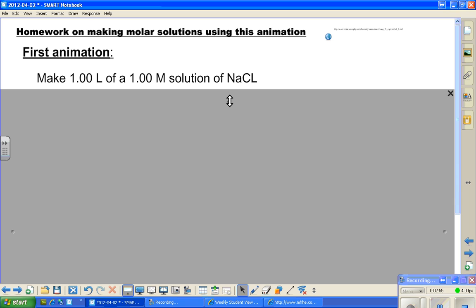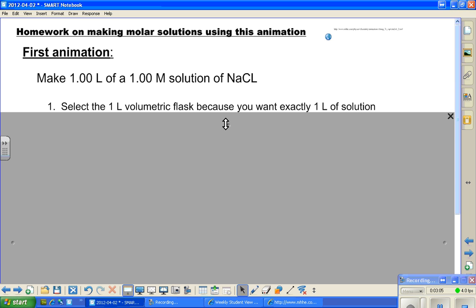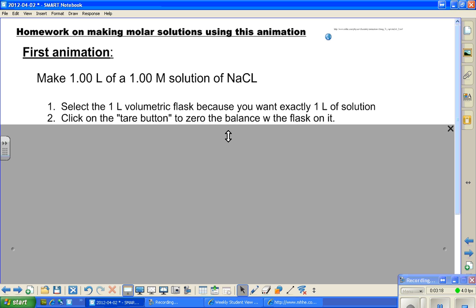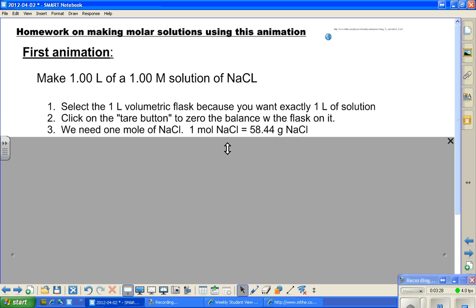In the first animation, I clicked on the make 1.00 liter of a 1.00 molar solution of sodium chloride, so I have to write that down. The first thing we did was select the 1.00 liter volumetric flask because you want exactly 1.00 liter of solution. Next, we want to click on the tare button that will zero the balance with the flask on it. Then we need to make one mole of sodium chloride, so we have to figure out the molar mass. I want you to figure that out and show me how much the molar mass is of each of the solutions that you're going to be doing.